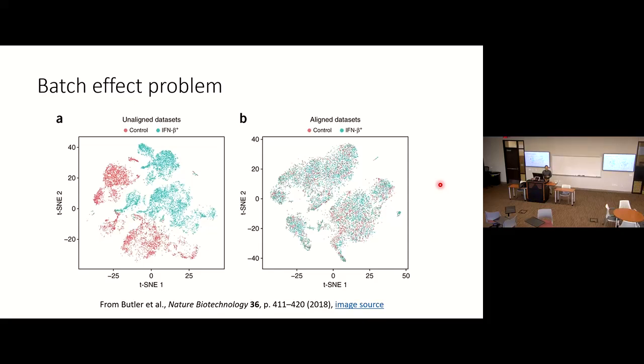I said I still don't know why, because if you follow our strategy for processing data, we cluster cells into subclusters. Our strategy is to over-cluster cells and then annotate the cell type.